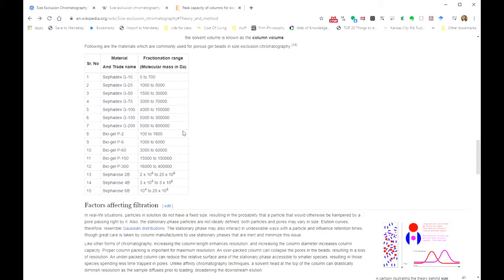Okay, so the first piece of information you need if you're going to answer this question, can I resolve my two peaks, is what is the resolving range? And this is the linear range on that chart that we just drew a minute ago. The second piece of information you're going to need is the peak capacity. We've talked about peak capacity before. This is essentially the number of baseline resolved peaks that you could possibly include in a chromatogram.